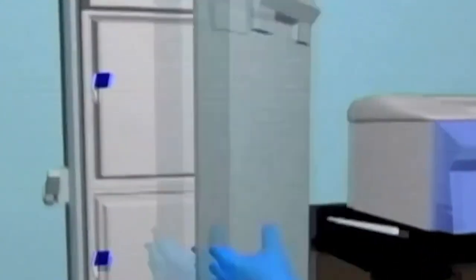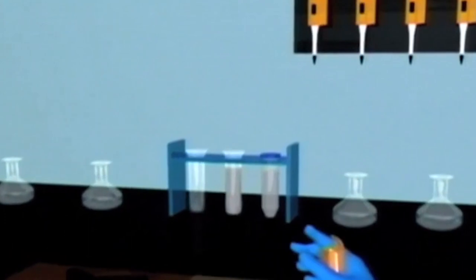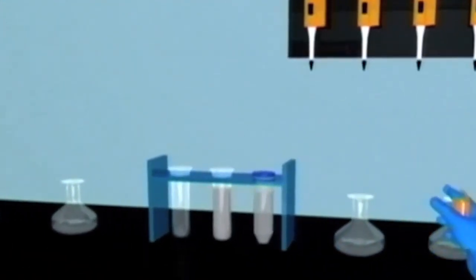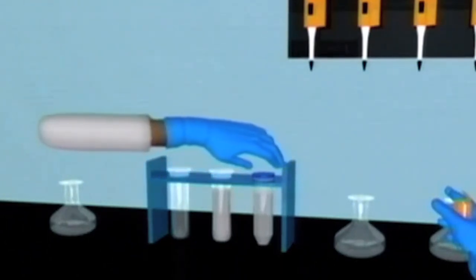Very carefully, the slides were removed from the minus 80 freezer. And now, one needs to thaw those slides very gently so as to avoid any diffusion type of effect. The typical laboratory setup does not require anything very fancy, because similar to the Western blot, all these steps can be performed.